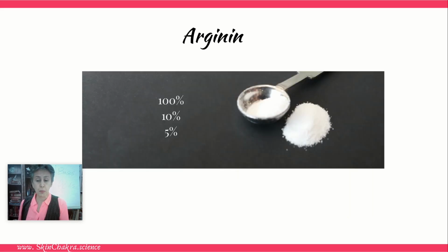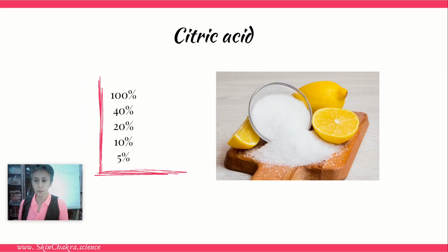Arginine is much milder and much more expensive compared to sodium hydroxide, but it is not that intimidating. And it comes as a powder, so it's 100%, and then it has a very low solubility in water, so you can prepare 10% and 5% dilutions.